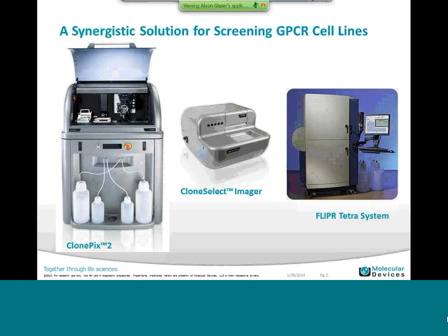Once cells reach appropriate confluence, cells are treated with an appropriate agonist to activate the GPCR signaling pathway. The Flipper Tetra system measures associated cytoplasmic calcium changes using a calcium-sensitive fluorescence dye. Thus, this validates that the positive signal as observed on ClonePix is indeed the functionally active GPCR protein of interest. Therefore, the three systems work synergistically together to provide a rapid and robust method for detecting GPCR proteins of interest.